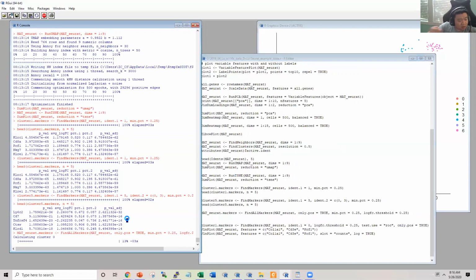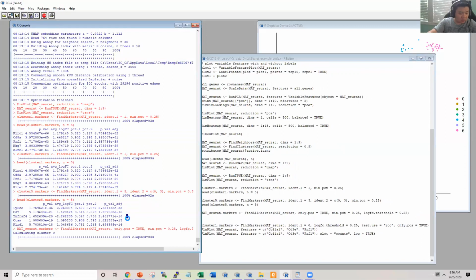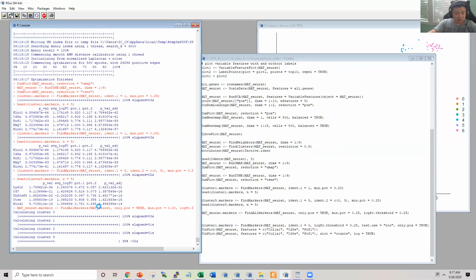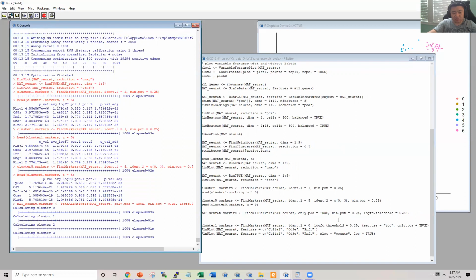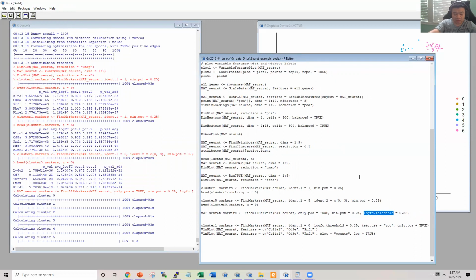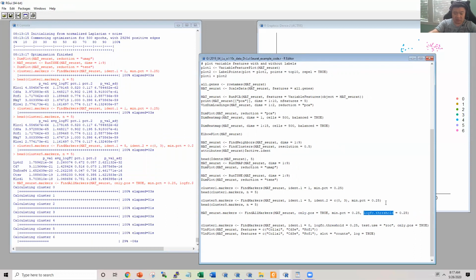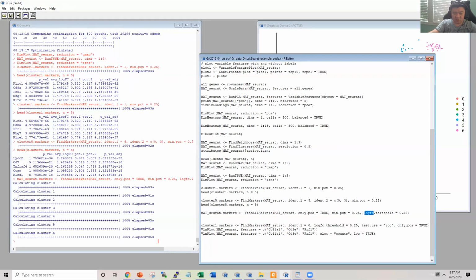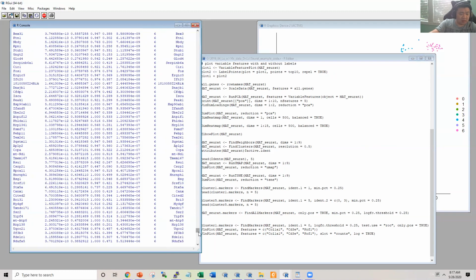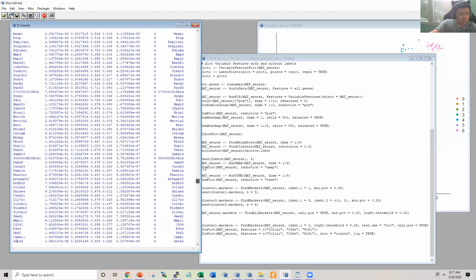The running of this approach is relatively slow because it needs to compute for every cluster. So if the data is very large and there are many clusters, this can be extremely slow. And I also want to mention the log fold change may not be so good for single cell RNA-seq data due to a lot of zero expressions existing there. When you compute the log fold change, it can be biased by the zero expression. But here is how the result of FindAllMarkers looks.